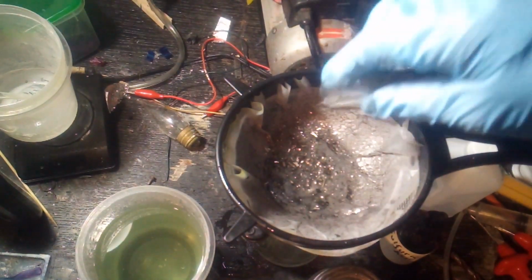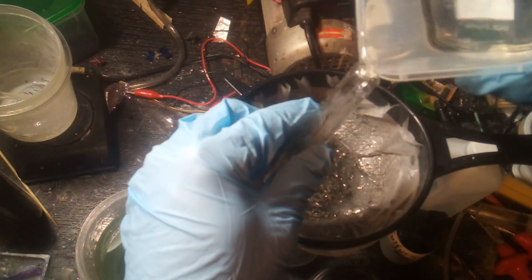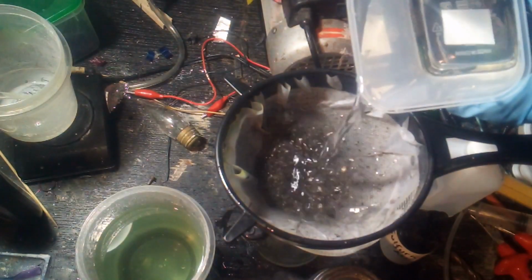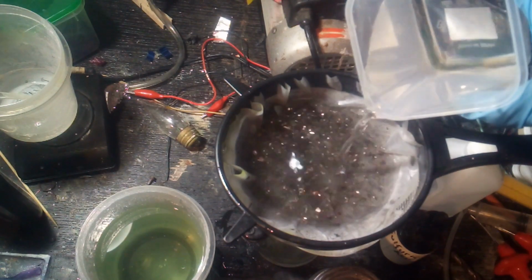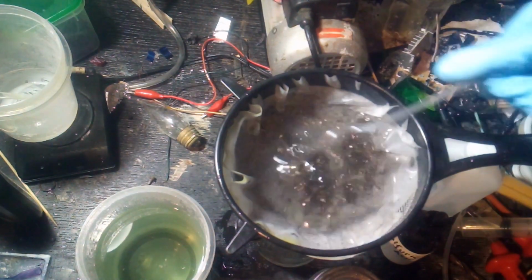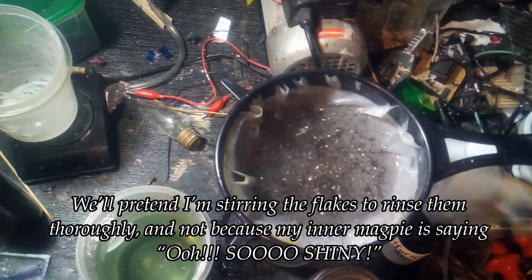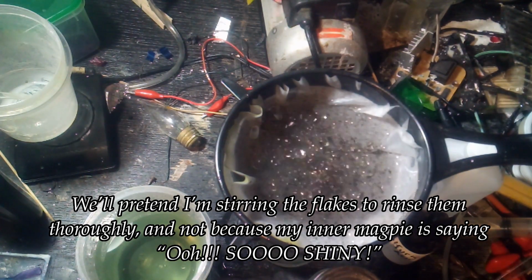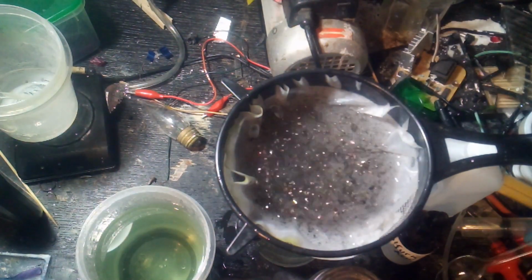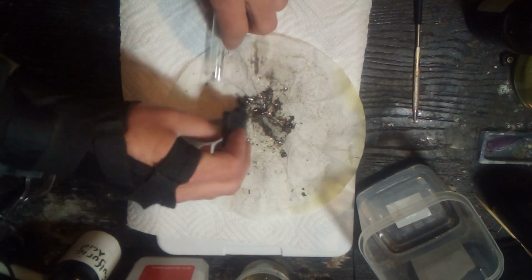Alright, I'm going to add the chromium flakes I collected in the test tube into here. Flush them all out with some distilled water. And pour some more distilled water onto here to wash all the acid off. Stir everything around a little bit. Chromium is now dried out, but a little bit stuck to itself.